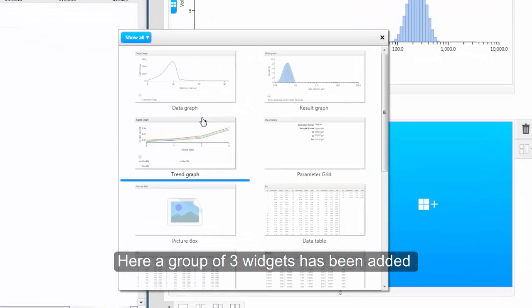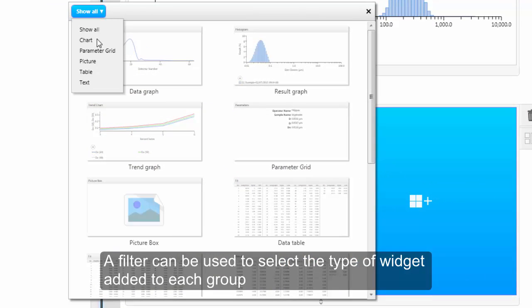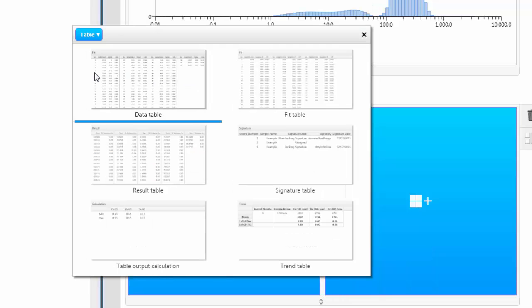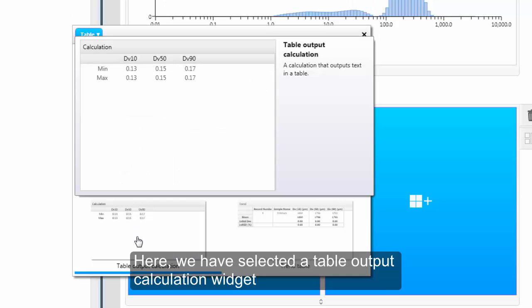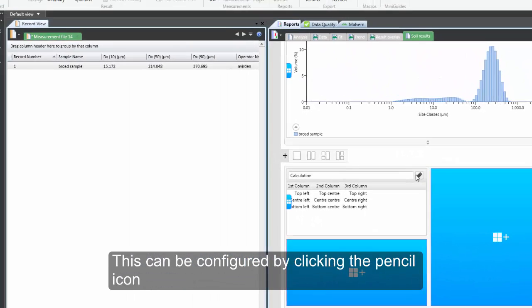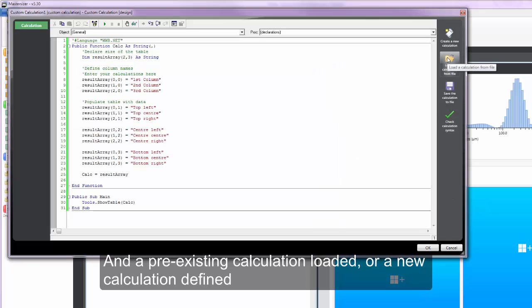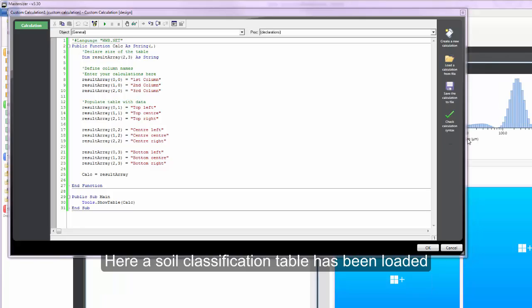There is a filter to help you choose what type of widget to add. And here I want to put in a table so I have filtered for tables. And I have selected a table output calculation as I want to add a custom table with specific soil classifications on it, which I can do by going to edit and loading the previously defined code.